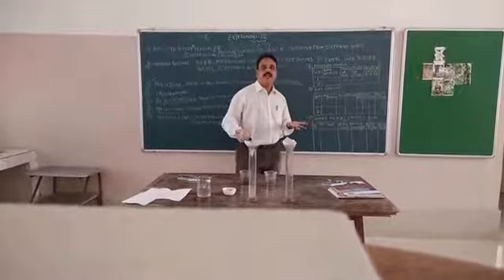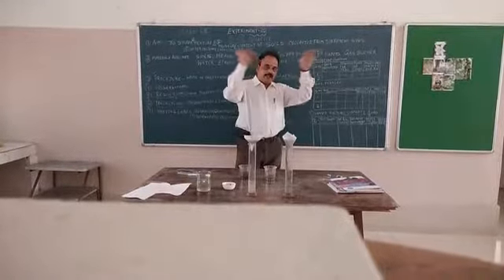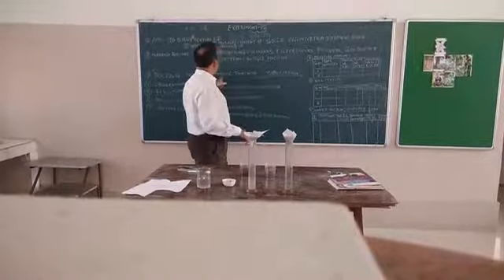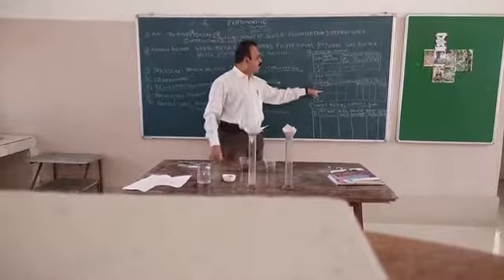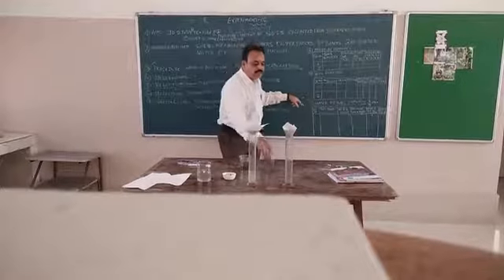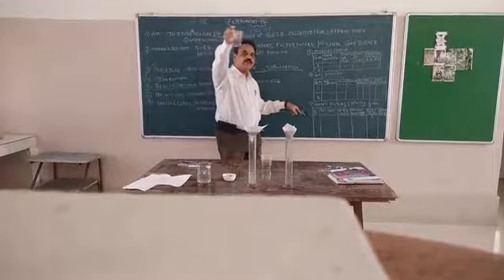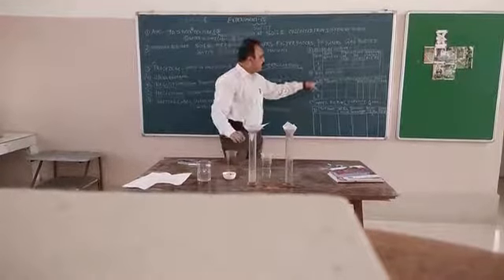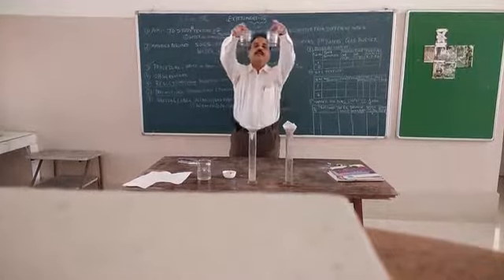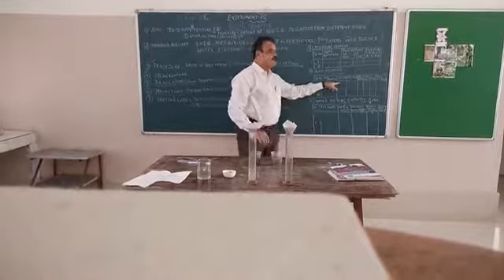For that, you just pour water in it. Then slowly you will see different layers. So that is about it. And for the observation, you can put it in tabular form, that is, write the serial number. I have picked up two samples, one next to our biology block and another from our science school agriculture farm, and you can see the color. Is there any difference? Yes, there is. So write the color of it.